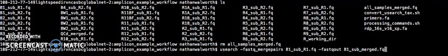So notice that we don't have to specify the b1 sub r2.fq file, because what usearch does is it searches for the b1 substring inside the same folder, and then it matches this file to its corresponding r2.fq file, which is really nice.